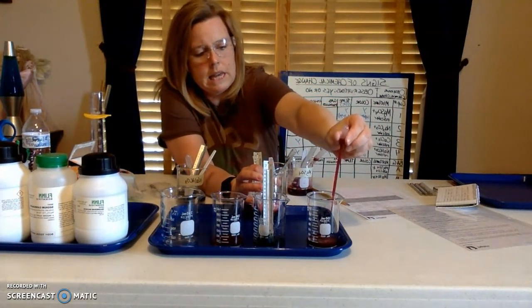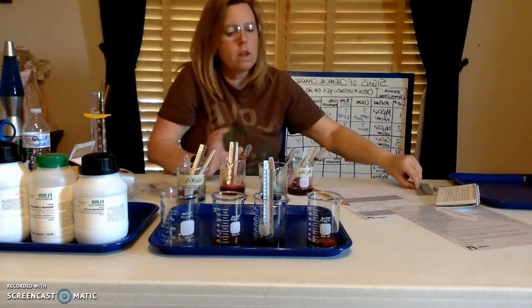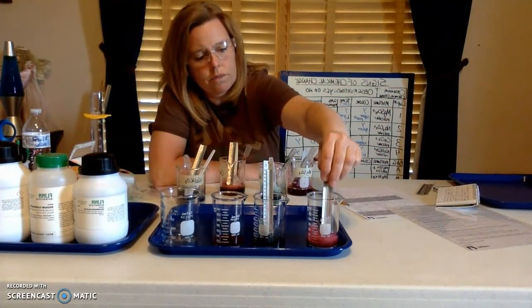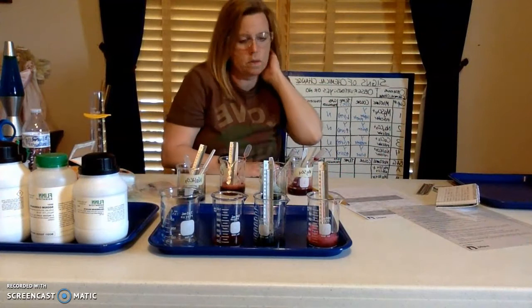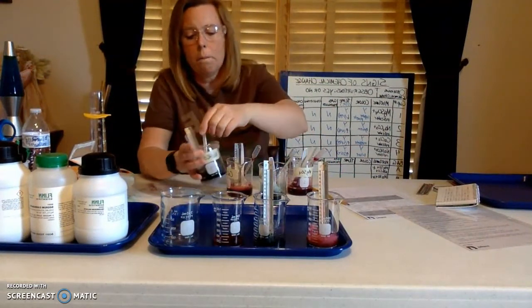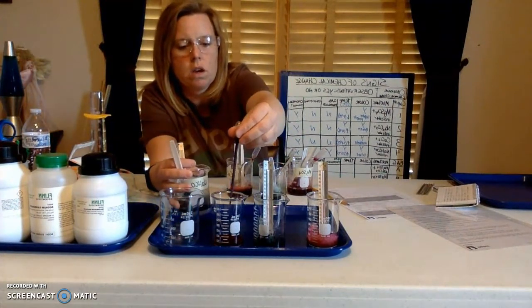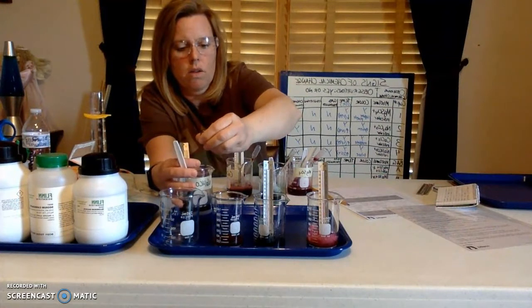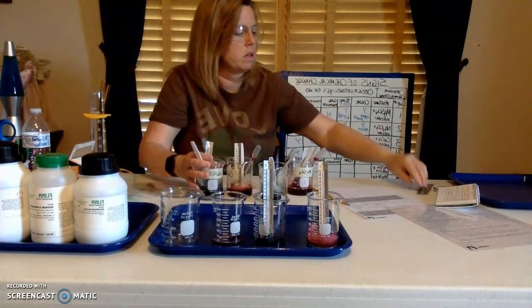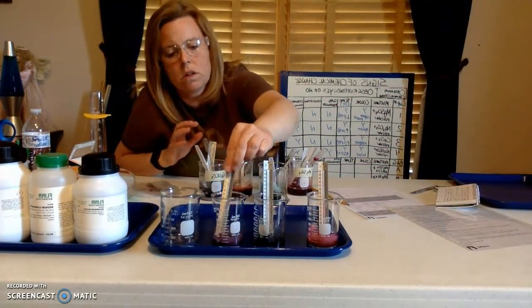Right away as it hits, I'm getting some bubbles. Let's put our thermometer in there. Give it a little stir. Okay, and we'll see if we get a temperature change with that. And then in baggie C, the sodium bicarbonate goes in there. Ugh. Kind of a nasty sound, isn't it? And we stir that. Obviously, we're getting some bubbles.